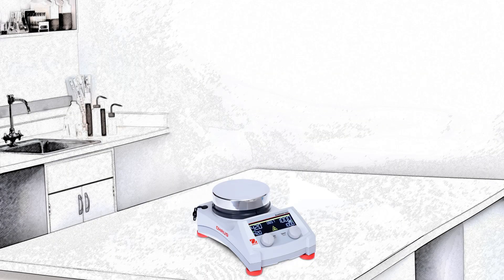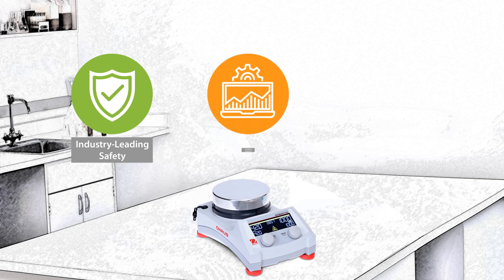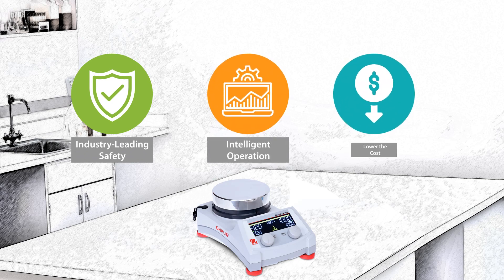The Guardian Series hotplate stirrers offer industry-leading safety features and intelligent operation to help modernize and lower the costs of doing business in science labs. Think safer. Think smart.